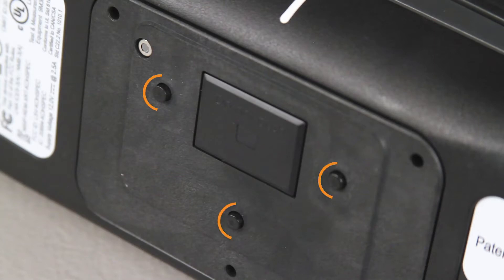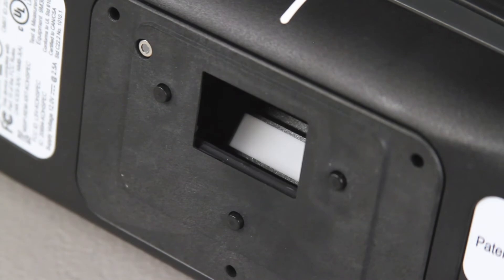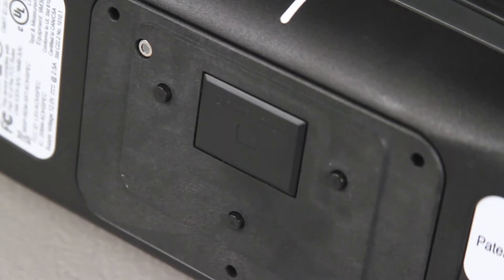On the bottom of your instrument are three pressure sensors, requiring even pressure across all three during measurements in order to ensure an accurate reading. The shutter will open when taking readings. Do not touch this or you can damage your instrument.